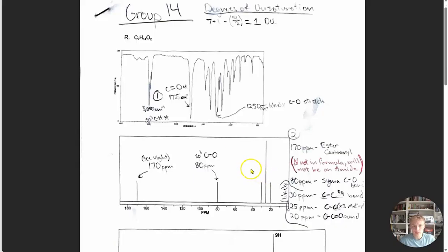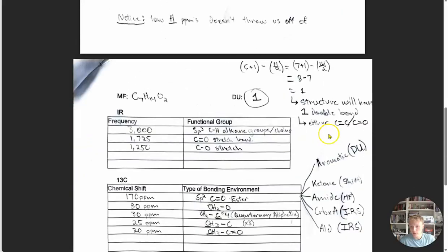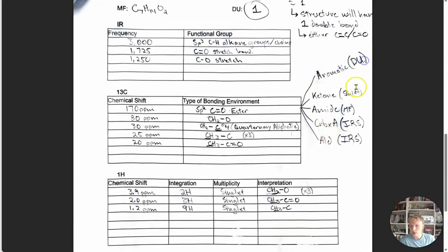All right. The other compounds that we want to rule out, we already ruled out an aromatic from our degrees of unsaturation. And we know this can't be a ketone from the CNMR value itself. A ketone would appear in the 195 to 220 or 200 to 220 ppm range. So the only compound left that we can really attribute this bond to is the ester.